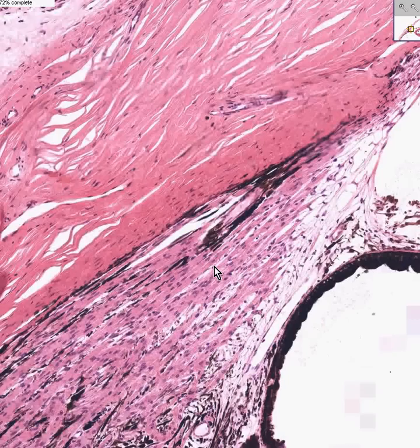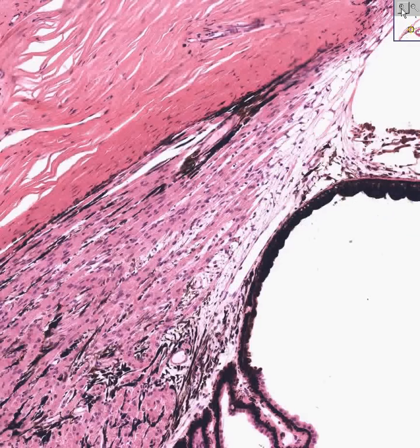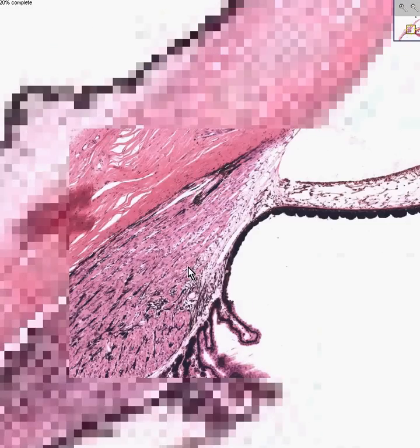Everything that's pigmented in here is now part of the middle tunic of the eye called the vascular tunic. And that consists of the choroid within the globe, the ciliary body and ciliary processes in this area near the limbus, and then the iris anteriorly.